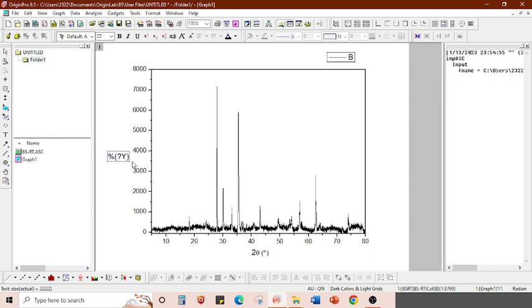Similarly, this is intensity. So select all, remove it, and type intensity. It doesn't have any unit, so I'm going to call it arbitrary units. Usually in most graphs we have units. If you do not have a unit, just give it as arbitrary units so that they know you have not missed the units and don't confuse it with other SI units.